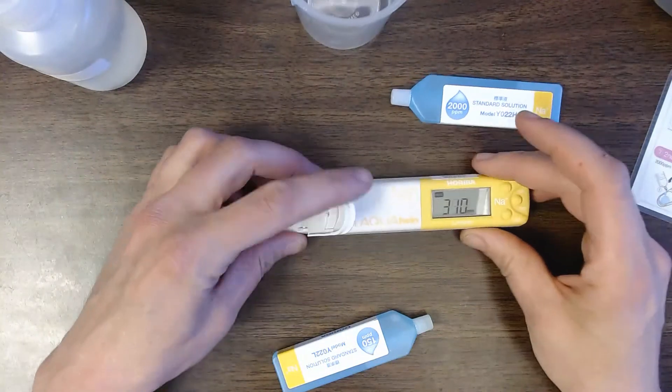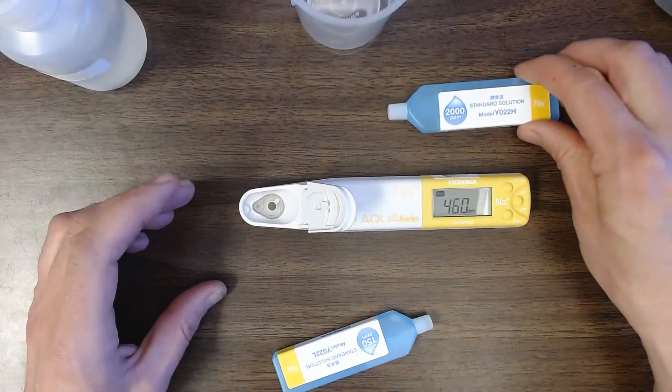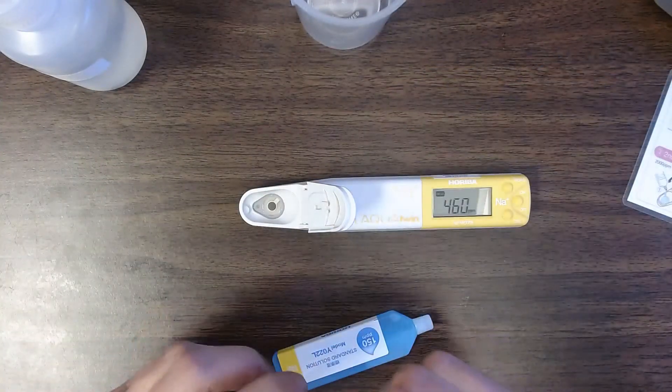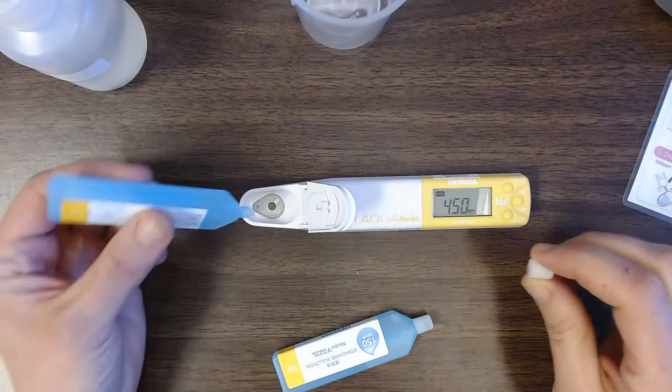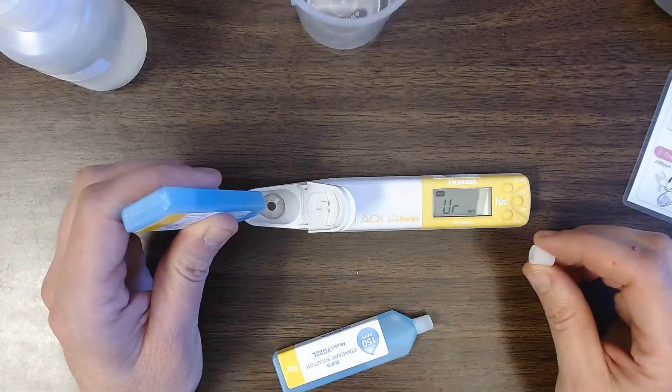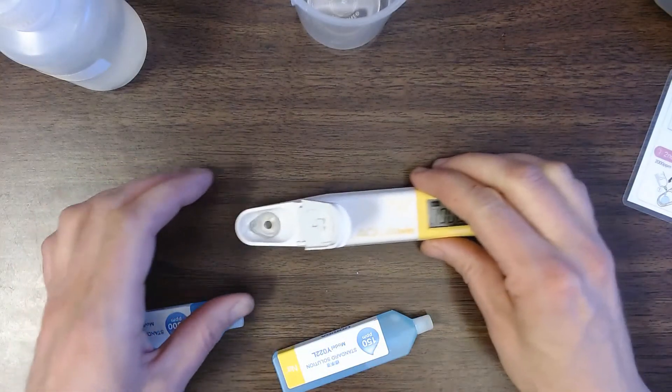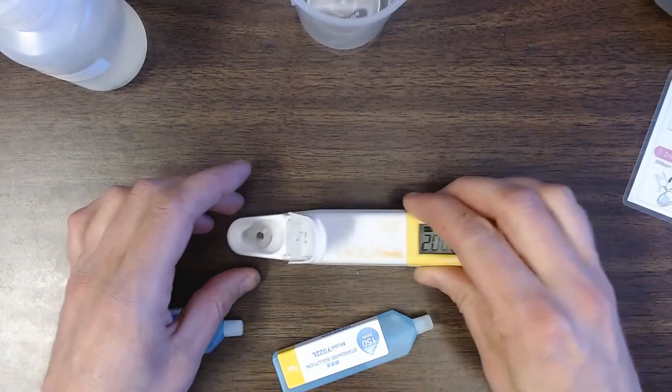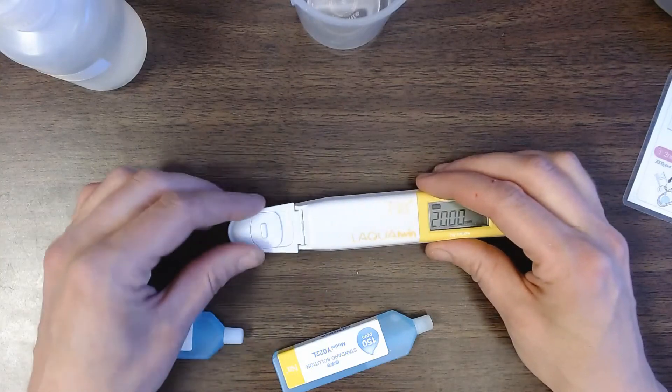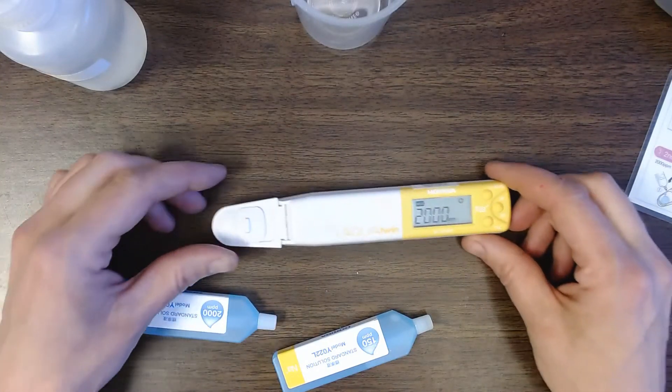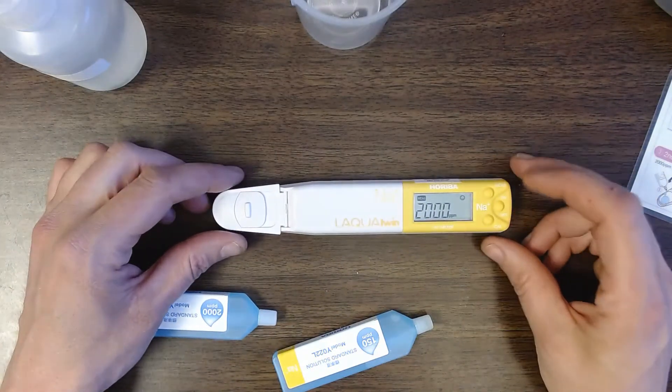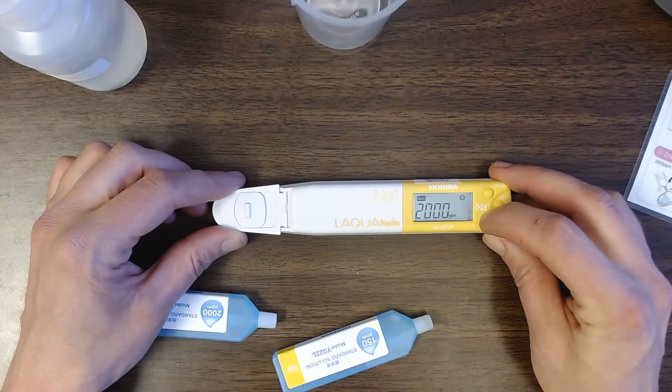Now we're ready to calibrate with the higher salinity solution. So 2,000 parts per million. Squirt that in. Give it a little shaky shake. Okay. Close the sensor. It's already reading 2,000 parts per million. So that's promising. But again I'm going to press the cal button.